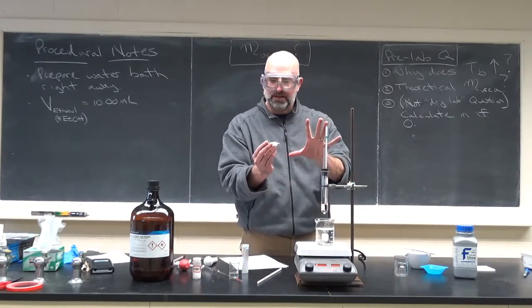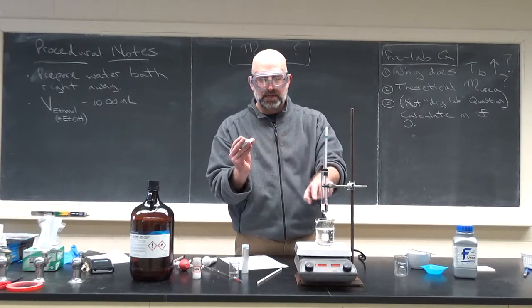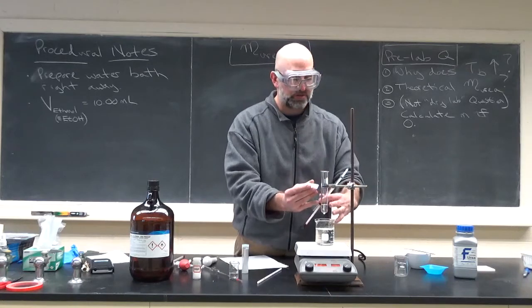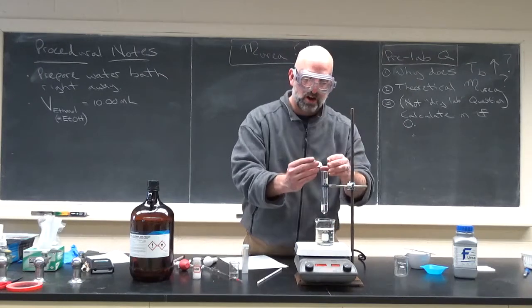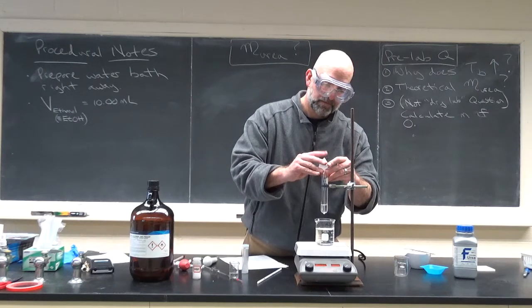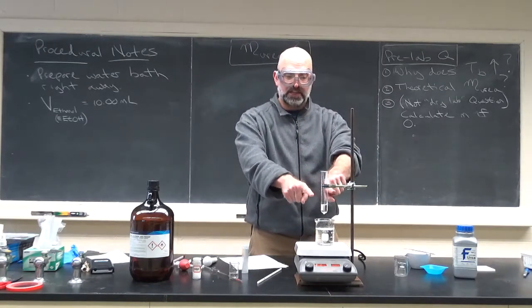This can get messy. You want to be very careful. You want to get all of this solid into the bottom. If you're kind of careless and you just sort of dump it in there, it's going to get all over the sides. If it does, even if it only gets a little bit, it's hard. So if you're careful, you can drop the solid right down the middle of the test tube, and I have a very small amount. If you're careful, have it all fall right down the middle. It doesn't even touch the sides.